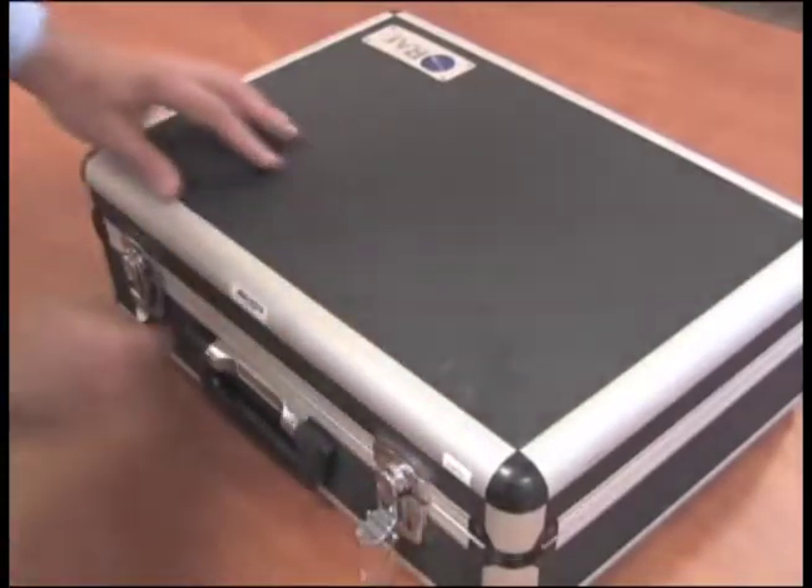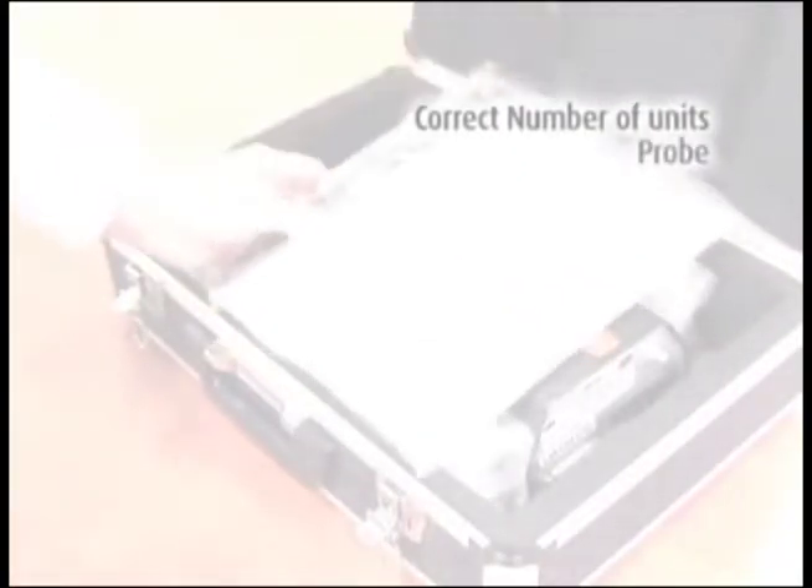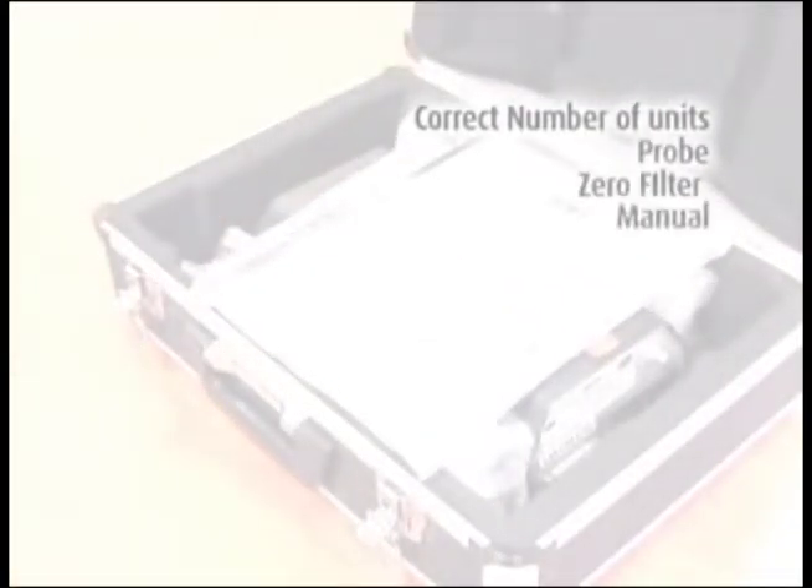When you receive the equipment, confirm you have received everything you ordered. You should have the correct number of units, probe, zero filter, manual, charger cord, and screwdriver.